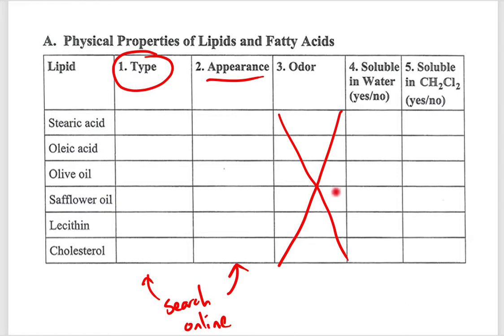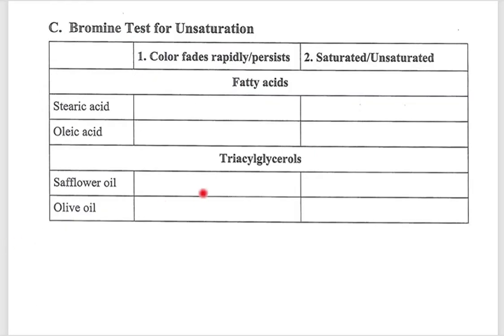And there's actually no video for this section just because it's pretty simple. We're talking about a bunch of different types of lipids. We've already defined them as things that are insoluble in water. So really there's nothing to be said for these two columns here except no and yes. These are lipids, so they're very nonpolar molecules, so they're not going to dissolve in water. You present them with a nonpolar solvent like methylene chloride, and they're going to dissolve. Really, the only video part is dealing with part C here.